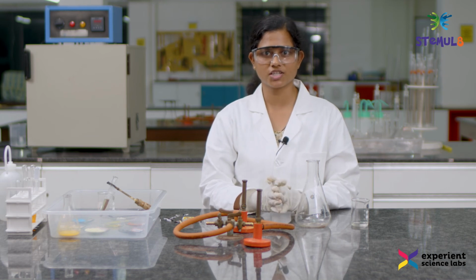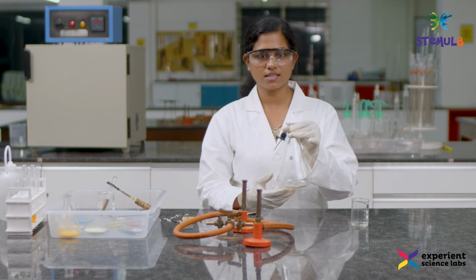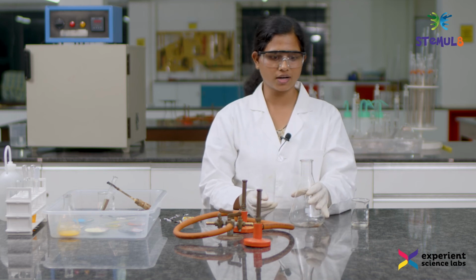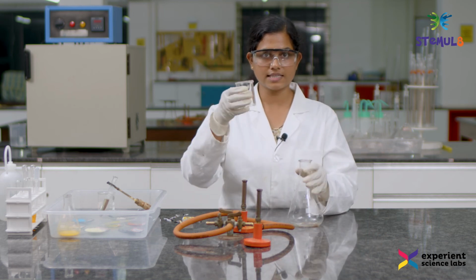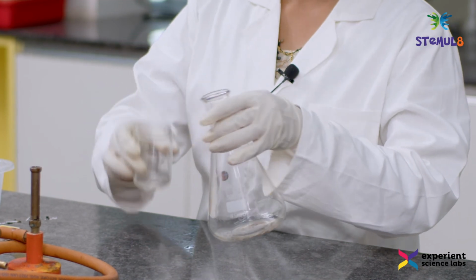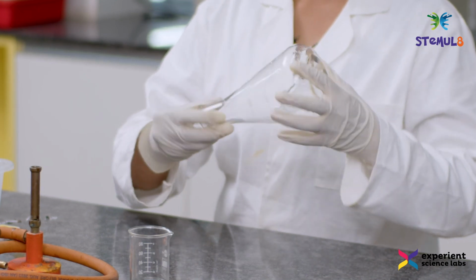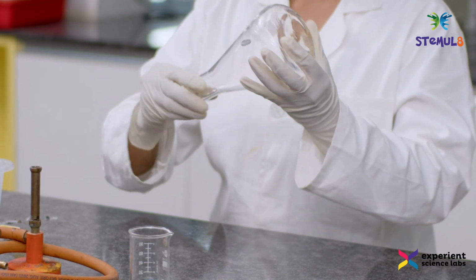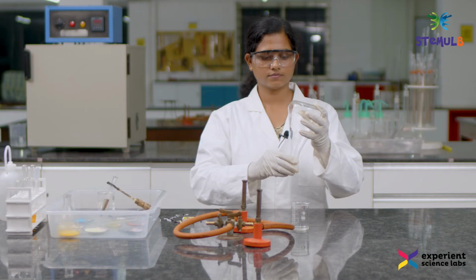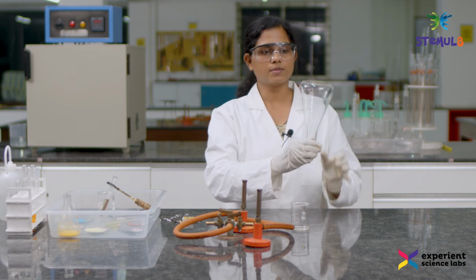Let us now look at the combustion reaction. The example that I am going to consider for the combustion reaction is the reaction of ethanol in presence of oxygen. So, this is a conical flask. I am going to add some amount of ethanol into it and we will see what happens during combustion. So, this is ethanol I am going to add into it. Rinse it well. Make sure that you do not have any excess ethanol left back in the conical flask. So now you see the conical flask is dry. Let us observe what happens during combustion.